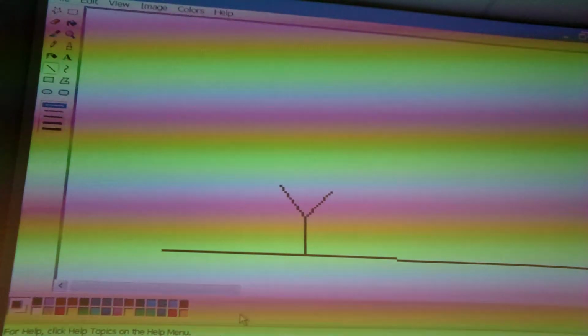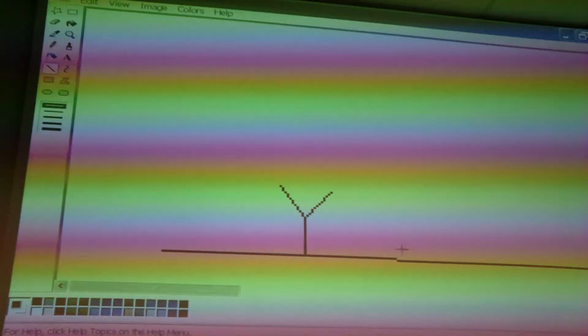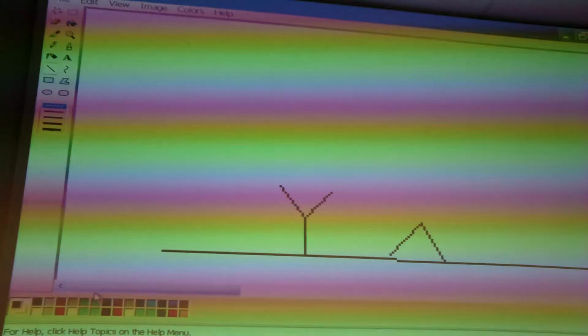Is it specifically always going to sit on the plate like this? Lots of it is going to sit completely wrong like this, right? So we're going to lose some of it. How do you compensate for that?